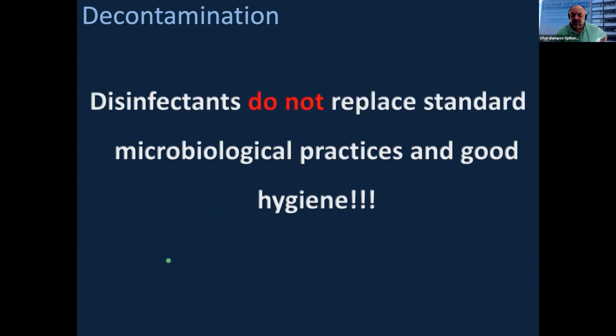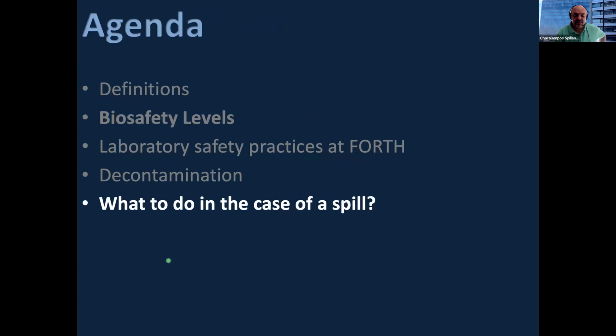But quite importantly, no matter what decontamination practices we utilize, it's quite important to follow certain microbiological practices, as we mentioned earlier, such as washing our hands, wearing gloves, lab coats, and certain practices we should follow in order to protect ourselves and others.